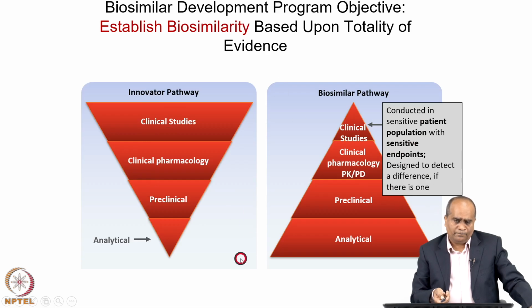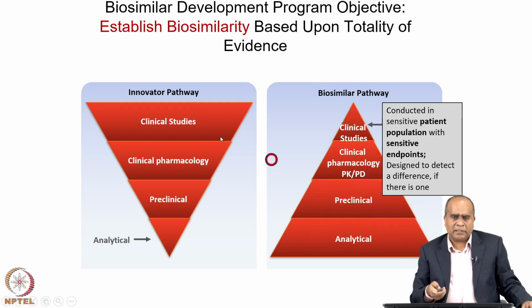So, what you need to do is that many robust analytical techniques have to be invoked to do a comprehensive analysis of a biosimilar. Then you do less preclinical and clinical work, and finally the end point is only small. If you look at this, it is quite huge for a biosimilar, and that is what we were emphasizing in this course: the biophysical methods which come under the analytical portrayal have to be done robustly. And in the case study that I showed you in the last technique, how we are going to use each of these is extremely important, right.